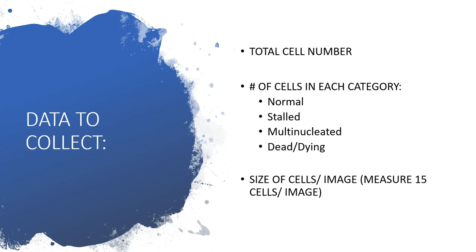We're going to revisit these slides later on in the semester and make some additional observations using all the knowledge that we learned over the course of the next few weeks. And that's going to help you practice your image skills, but also your microscopy observation skills as well.